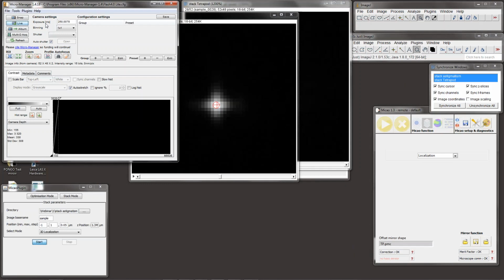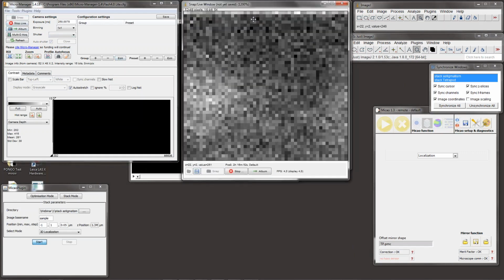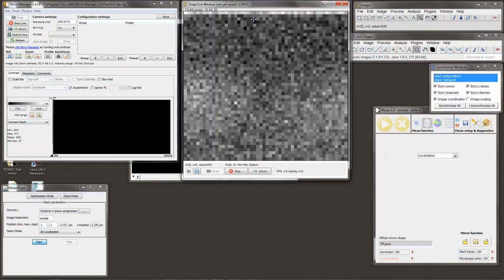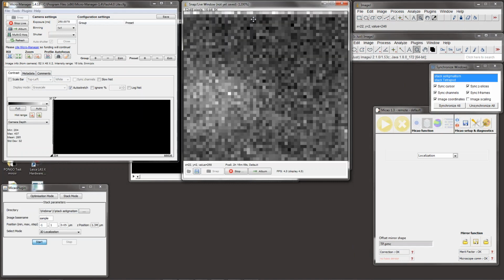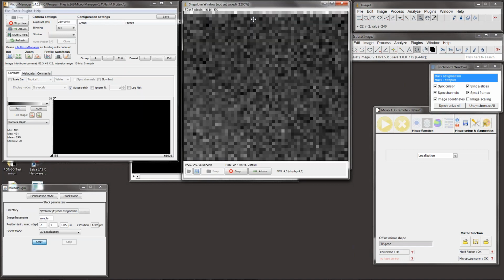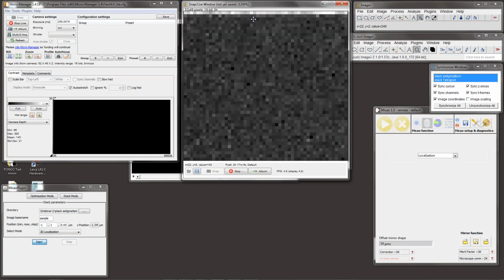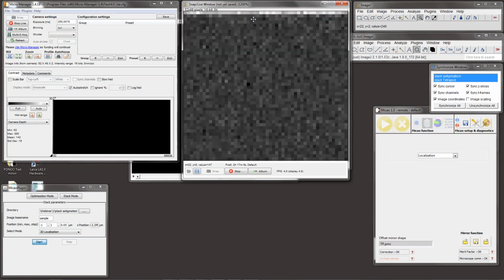So we had a couple of questions. I already answered them privately, but it was actually posted publicly in the question tab. But if you missed it, let me reformulate them. So the first question was that because in this example we use a single diffraction limited sample, does that mean that the aberrations are going to be corrected only for that small area in the image? And how would you get homogeneous correction for the whole field of view?